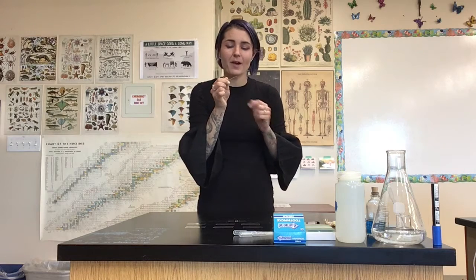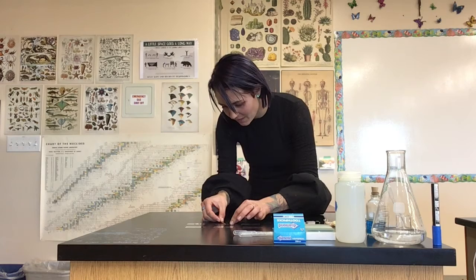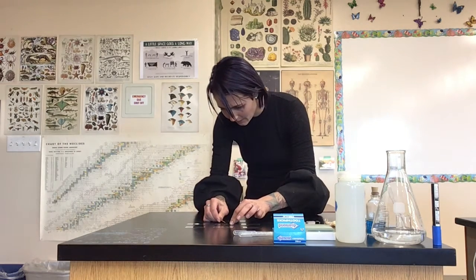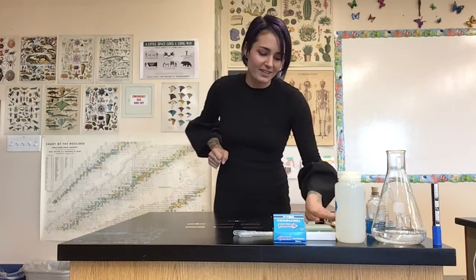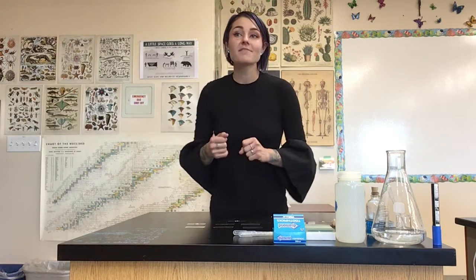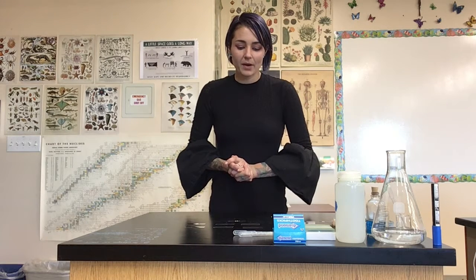As I was scraping, I was rotating around just to increase the chance that I got some cells on all parts of the stick. You can't really tell much on the slide that I used my cheek cells for. That's because it just looks like spit. But there might be some cheek cells in there. So we're just going to let the hydrogen chloride do its thing. I'm going to go get some more gloves and get some paper towels so that we can blot off the extra. And then we can jump right into the next few steps.